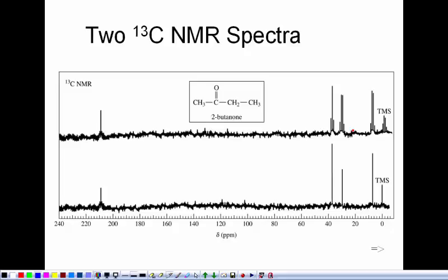So what you can do is count up the number of carbons and say, oh, I have 5 unique carbons in my molecule. Well, my structure better have 5 unique carbons in it. The hydrogens may be a different number there. So we've got a bigger chemical shift scale. Our reference is still TMS, only in this case, it's the carbon of the 4 CH3s. That's our reference, so we set that at 0.